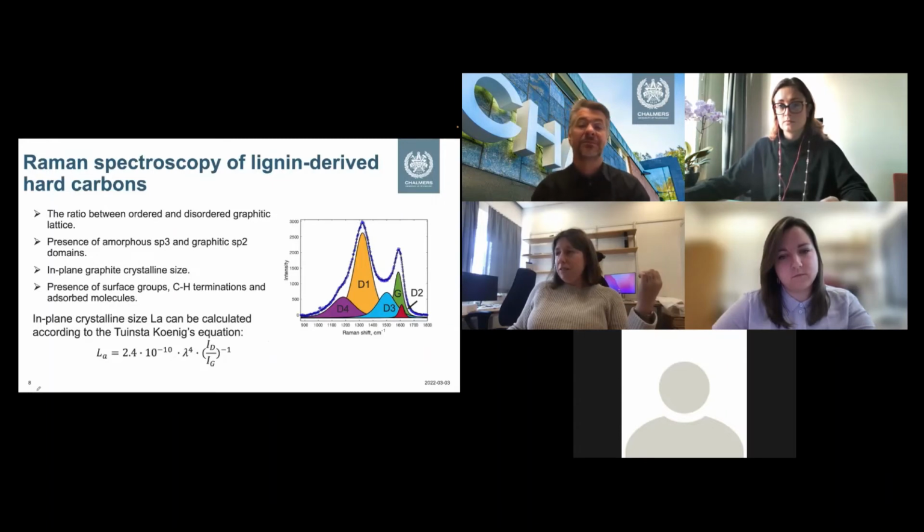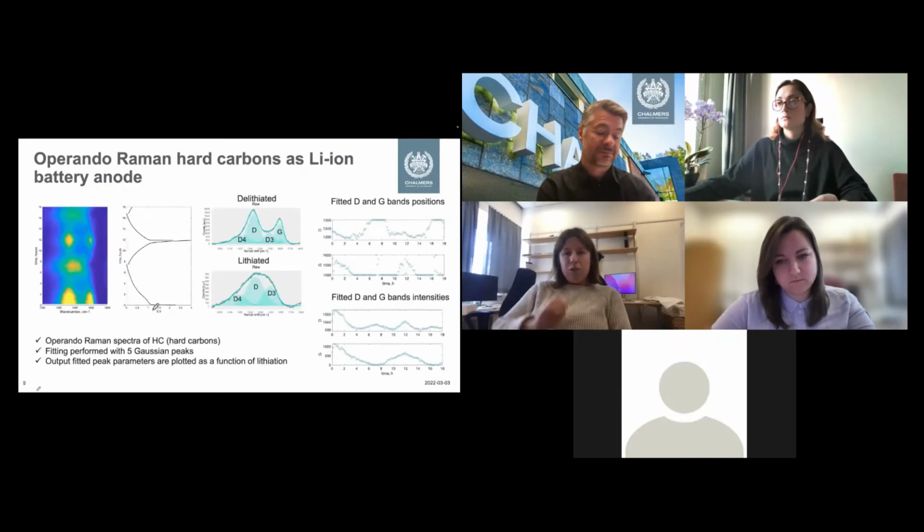In this case, D is D1. And we can also get an idea of the presence of surface groups, CH termination, adsorbed molecules, etc. in the material.